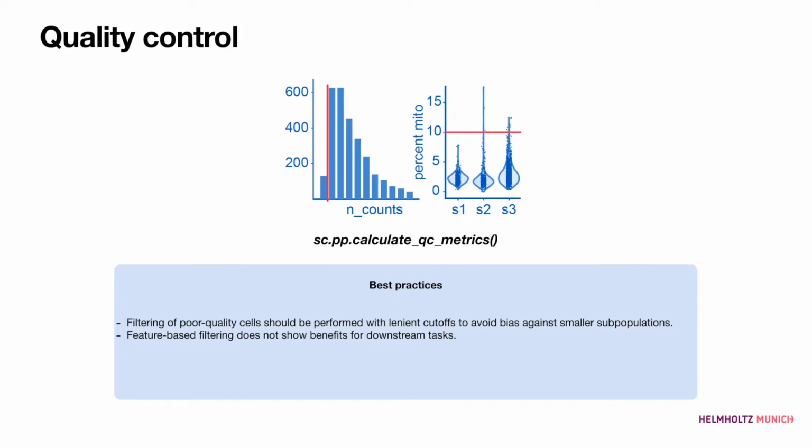And this is where you can actually try out all these functions and try and figure out yourself the best thresholds for filtering data. Or you can also see the effects that it might have on the downstream analyses if you don't do this filtering, because you may have, for example, some extra clusters popping up if you don't filter low quality cells beforehand.